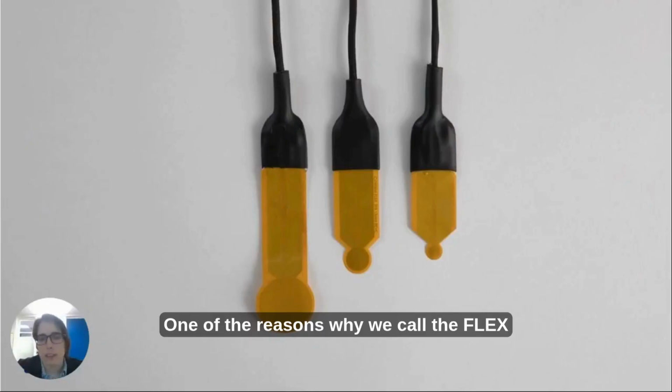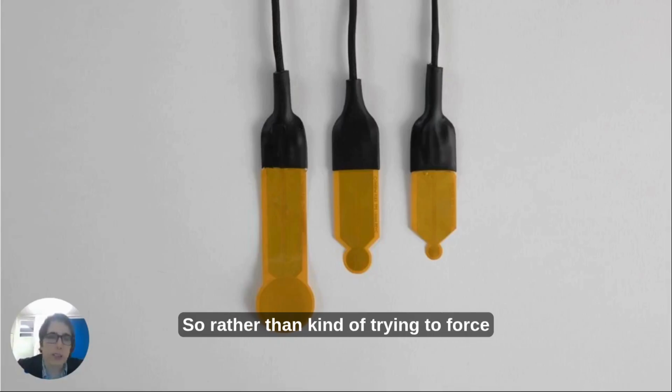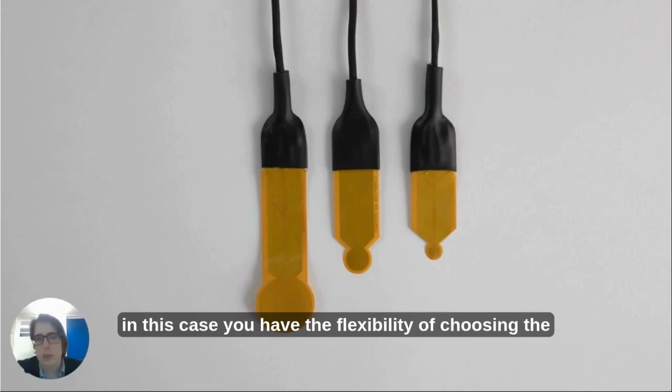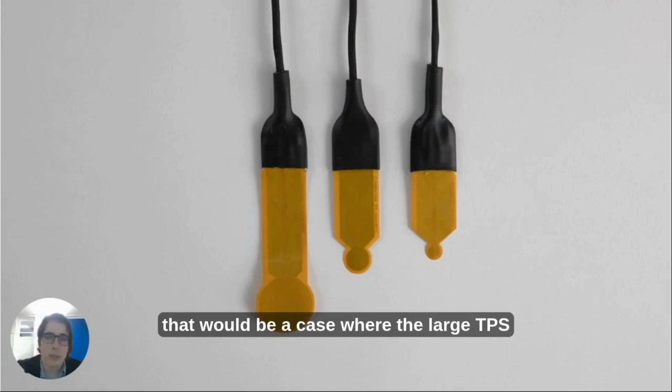One of the reasons why we call the flex method flex is because of the range of sensor sizes available. So rather than trying to force your sample to conform to the sensor size, in this case, you have the flexibility of choosing the sensor size that fits the sample. The smallest sensor size here is appropriate to very small samples. And the largest sensor size there is 30 millimeters in diameter, and that would be appropriate to materials which tend to be highly heterogeneous. So, for example, if you were looking at a volcanic tuff with a lot of different sizes of materials that are consolidated into that tuff, that would be a case where the large TPS sensor might be the most appropriate.